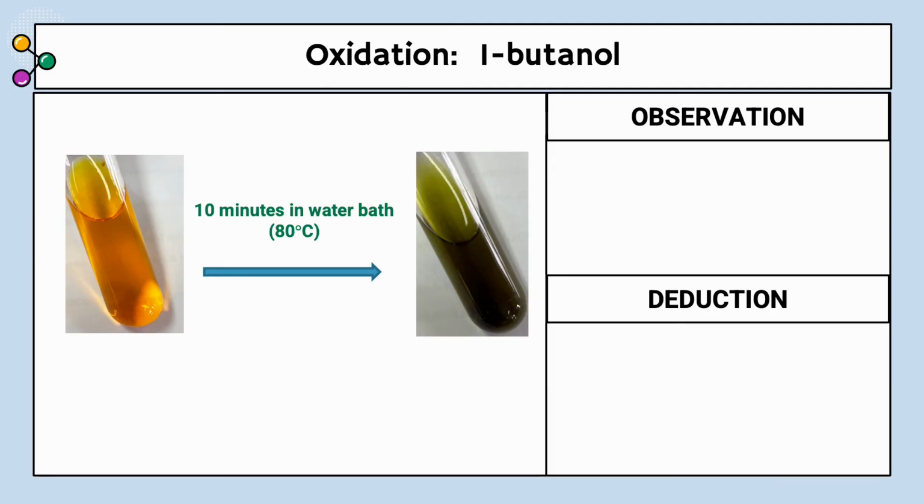Since alcohol itu adalah colorless, so the color changes that we're going to observe adalah color changes of sodium dichromate. Sebab apa? Sodium dichromate, since dia ada dichromate ion, the color is orange color. So when sodium dichromate undergo reduction, maknanya ada reaction berlaku, dia akan produce green color. Green color ni dia refer ke sebab apa? Sebab the reduction of sodium dichromate akan produce chromium 3+. Chromium 3+, the color is green. Sometimes awak akan dapat warna macam turquoise. Itu pun boleh diterima jugalah.